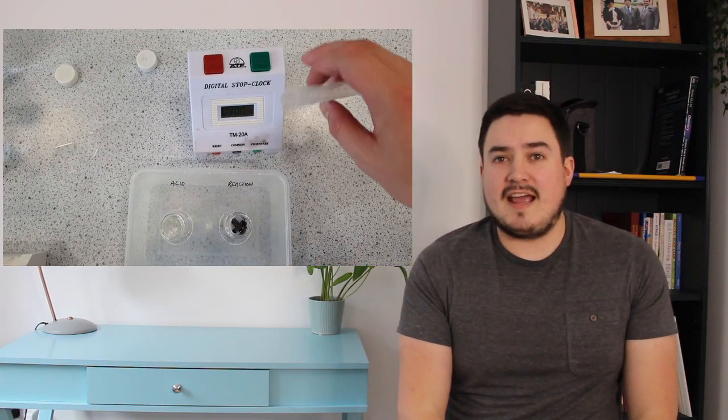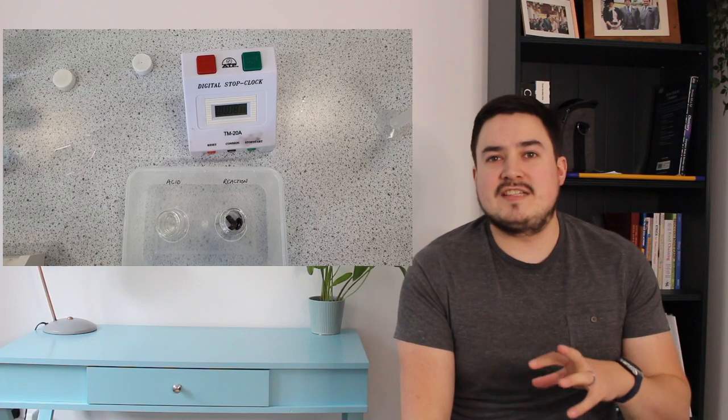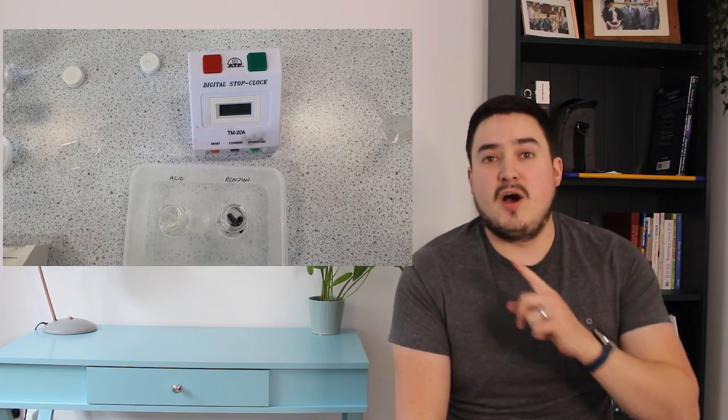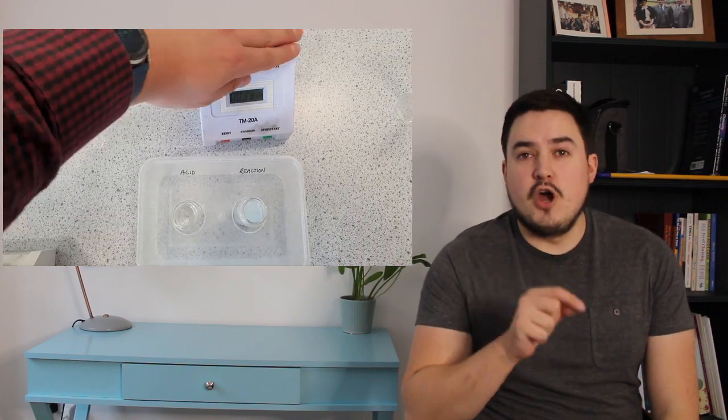In this video, I've set up a mixture of hydrochloric acid and sodium thiosulfate, and I'm timing the reaction to see how long it takes to change colour. Underneath these pots, I've put a dark cross, and I'm starting the timer when I mix the two solutions. I'll stop the timer when the cross is no longer visible, and that'll be different for different people.